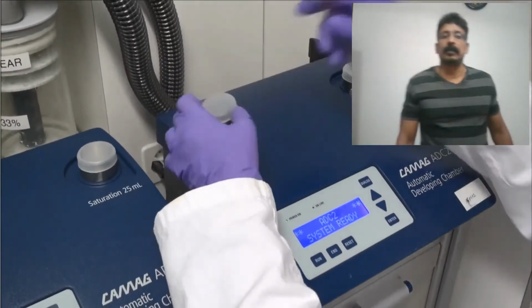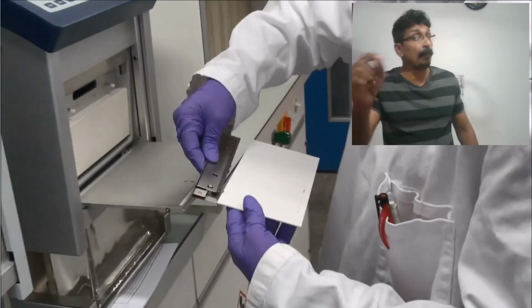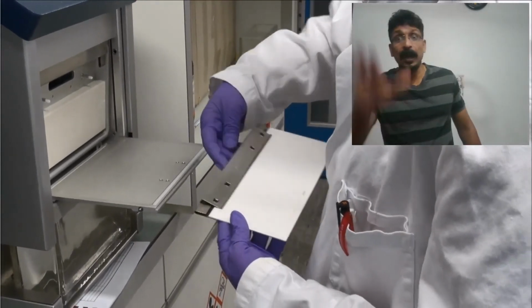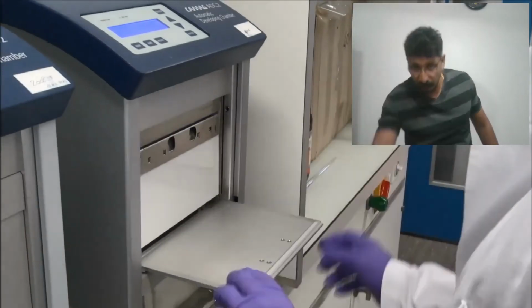And it will make saturation of the chamber. Now she is keeping the plate. Already the samples have been spotted and fixed there, and she is keeping the plate in the top place. You may think it is in the top, but when she closes, it will come down to the chamber automatically.